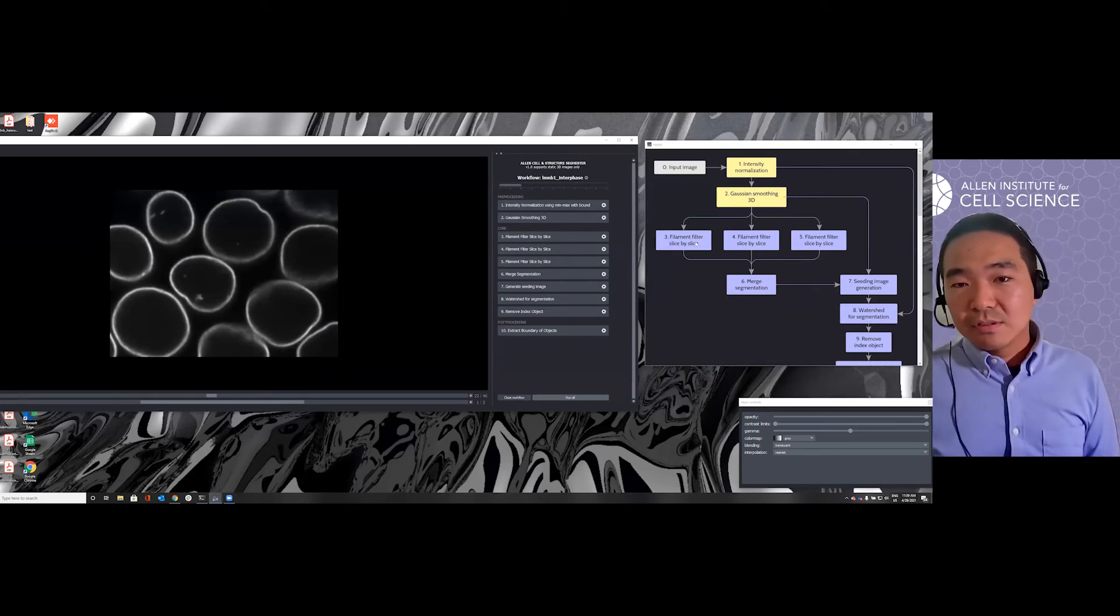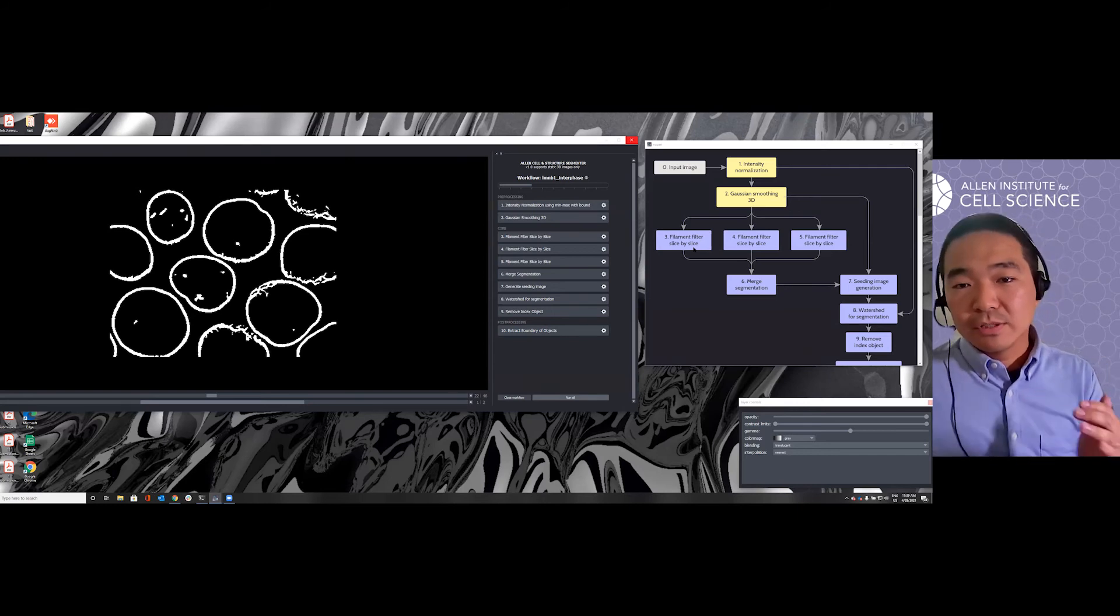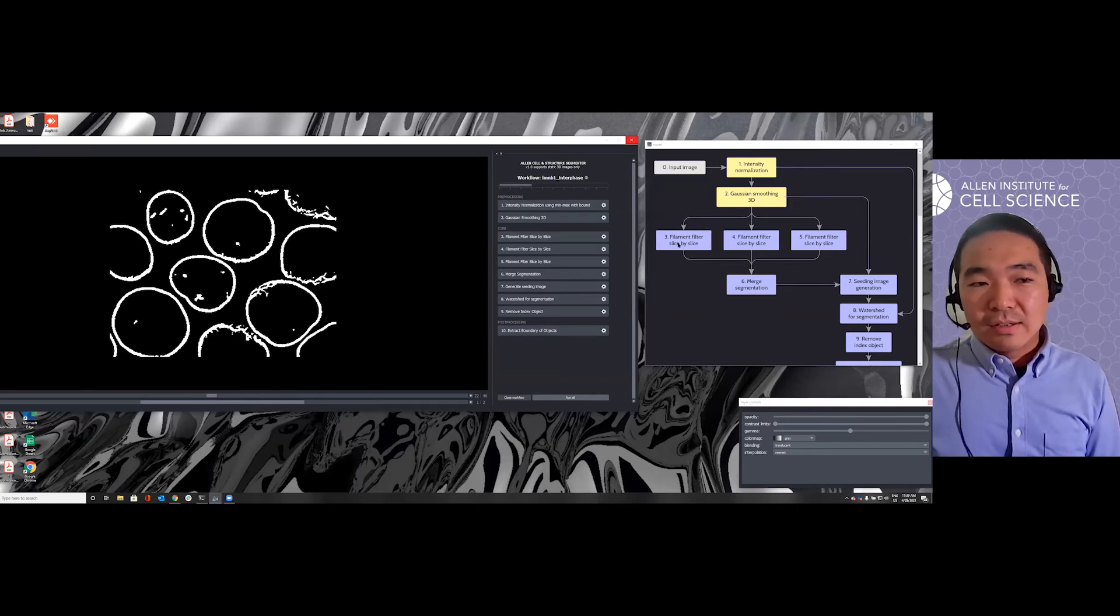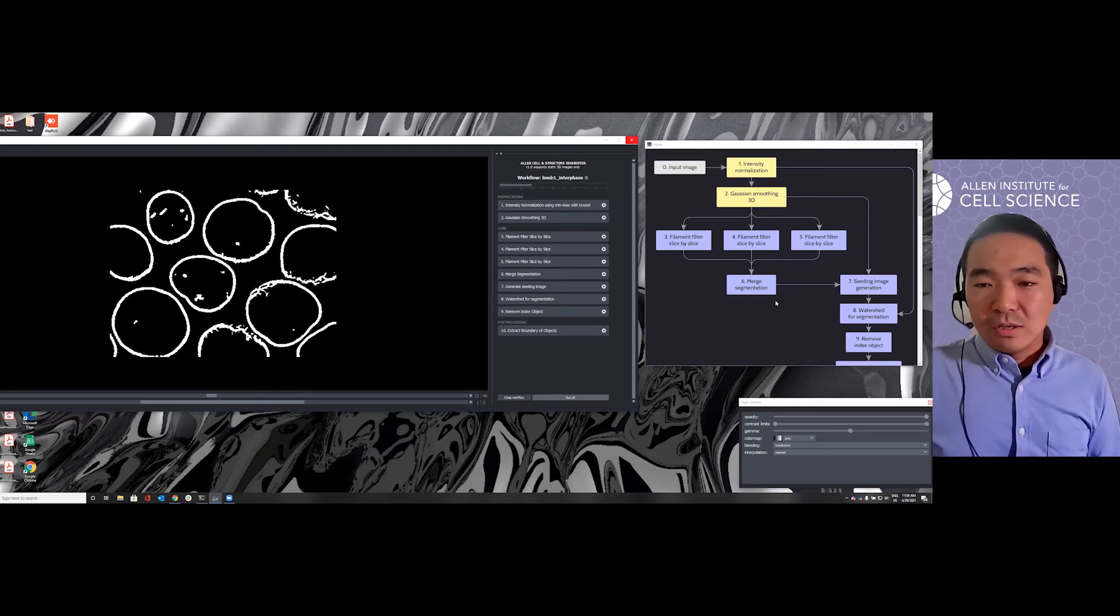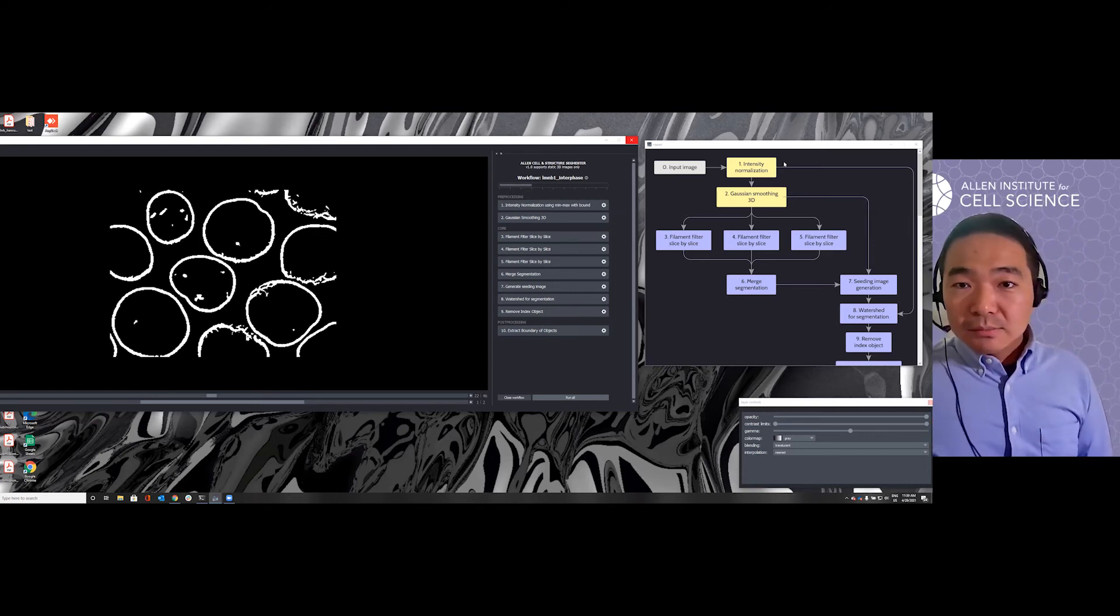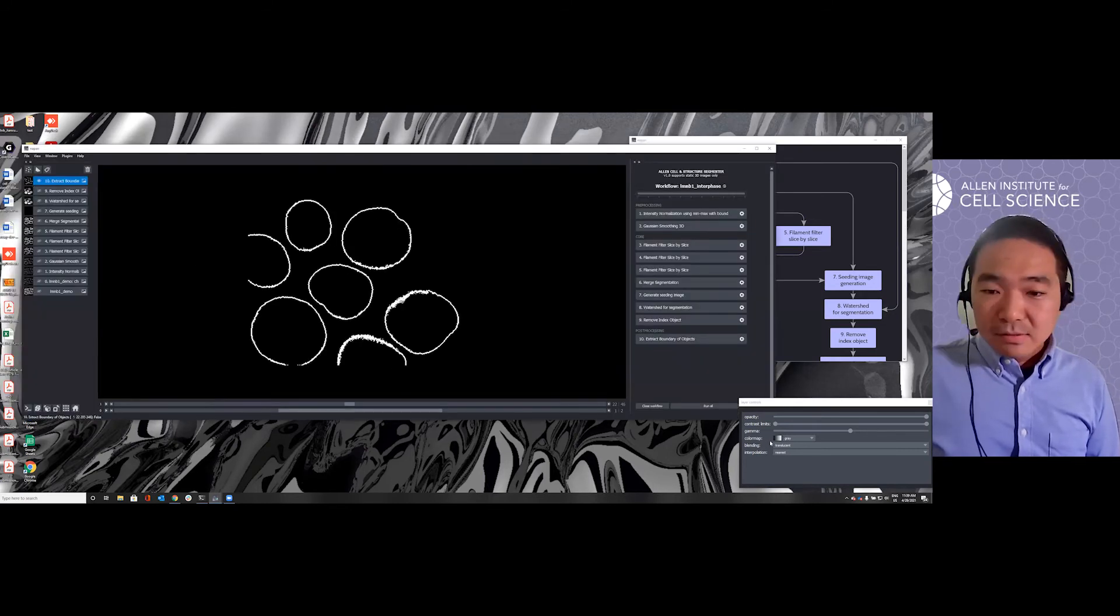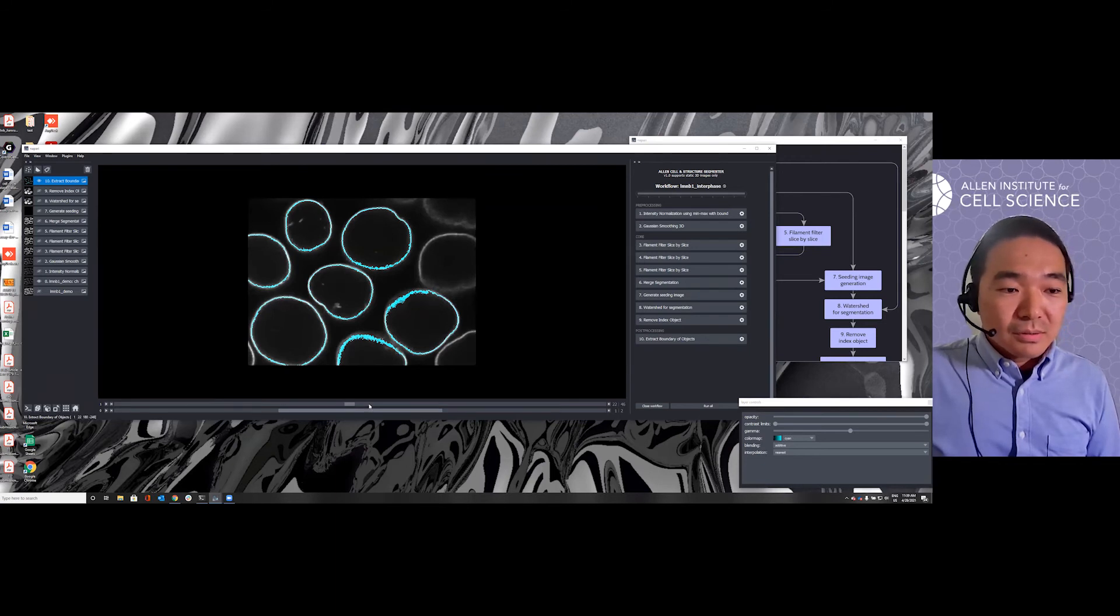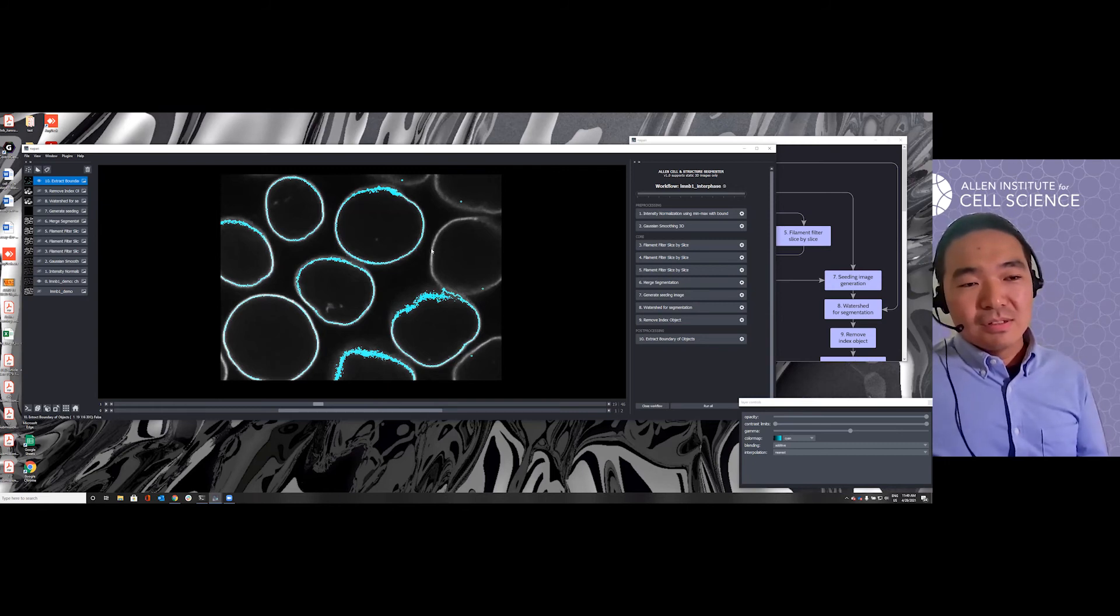Basically, the key difference here is after doing the normalization and smoothing, we are applying the filament filter slice by slice at three different sets of parameters, and then merge them. We want to use this filament filter to catch this ring. And then we use this ring to localize each individual object. And then we use the individual object to do a watershed to get the final segmentation of Lamin B1. Here is the output. As we can see, the result is pretty good, except something is missing.